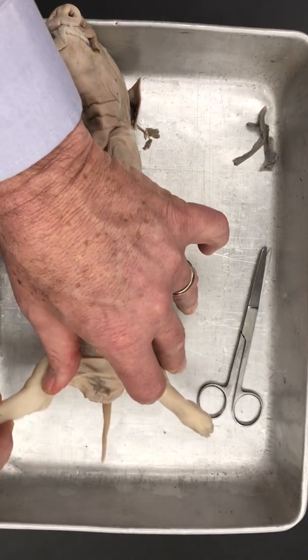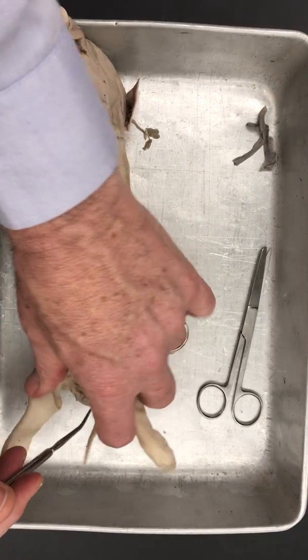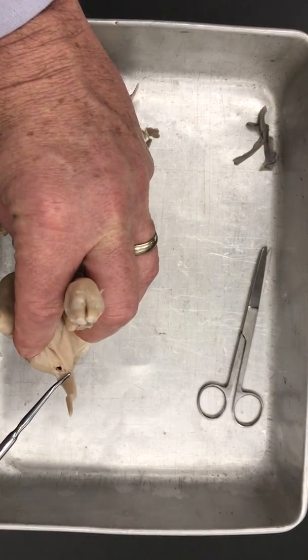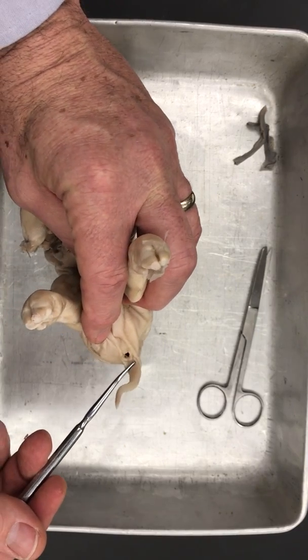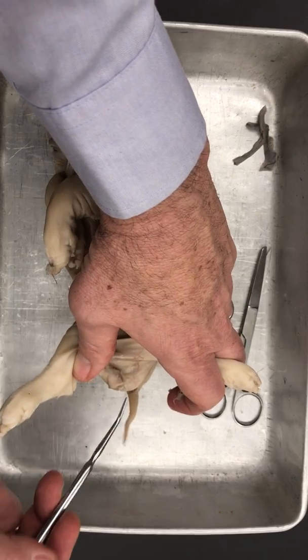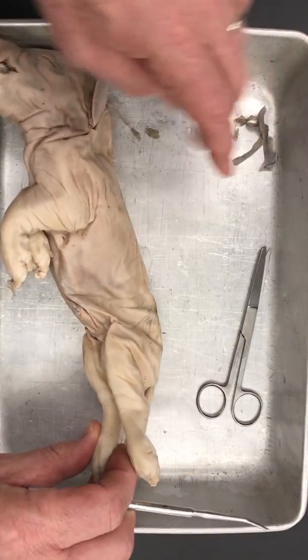So how do you tell those apart? Well, I look under here and I look for the scrotal swelling, okay? And that's ventral to the anus. So the anus is right there. Both male and female pigs have an anus, okay? So this is the scrotal swelling. This is some extra skin. We'll just get rid of that, okay?